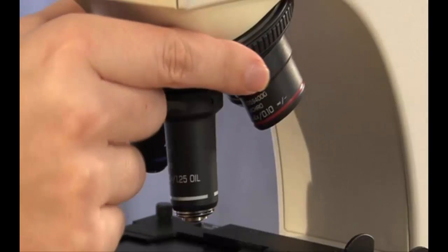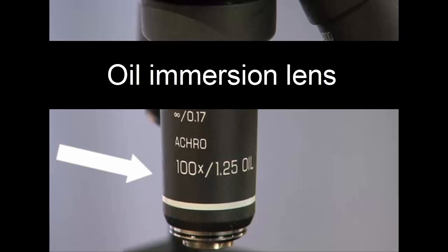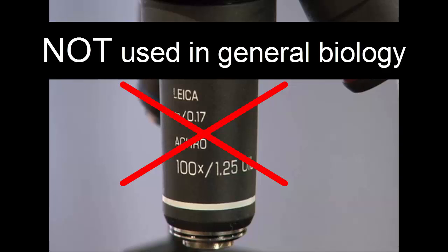Finally, the 100x lens, also known as the oil immersion lens. This lens is only used in our microbiology courses and should not be used in our general biology lab.